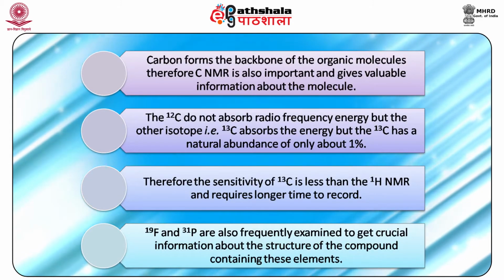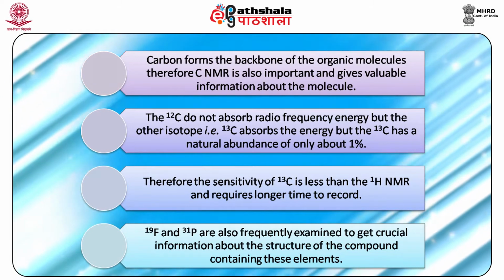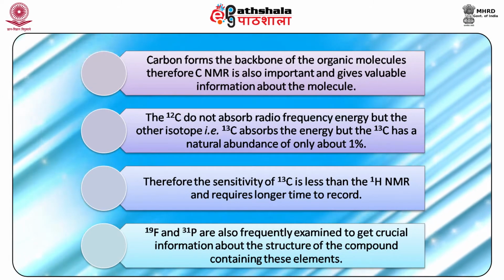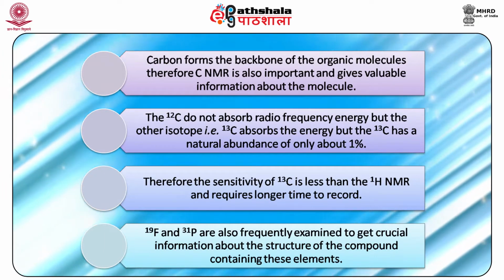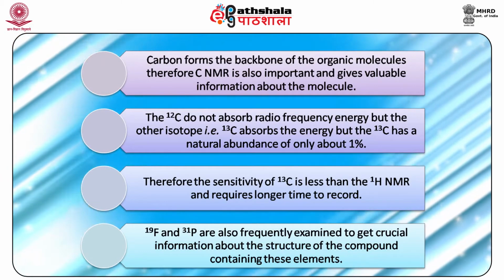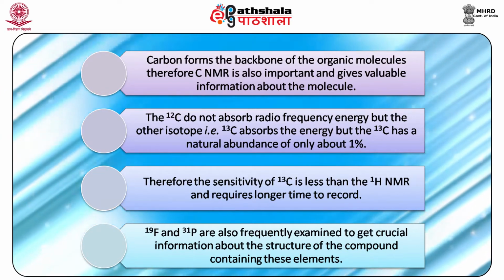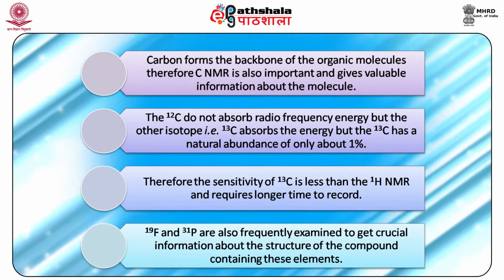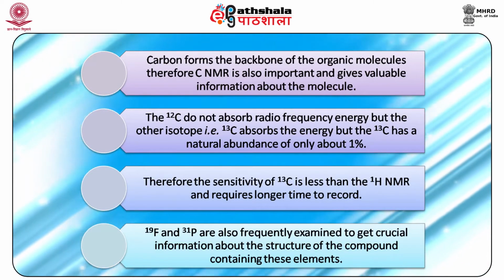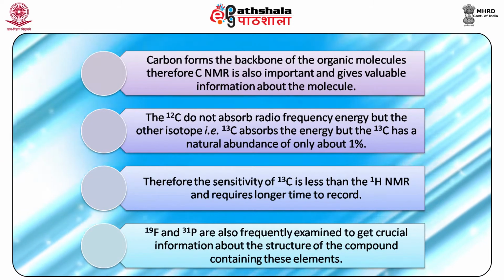Carbon forms the backbone of the organic molecules. Therefore, 13C NMR is also important and gives valuable information about the molecule. The 12C, that is the 12 carbon, does not absorb radio frequency energy, but the other isotope, that is 13C, absorbs energy, but the 13C has a natural abundance of only about 1%.